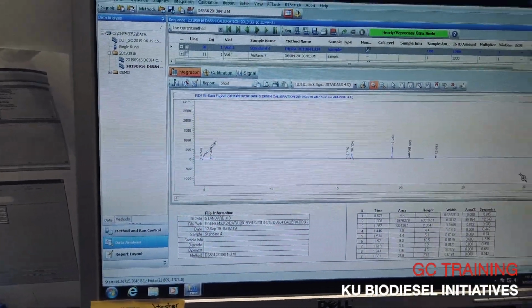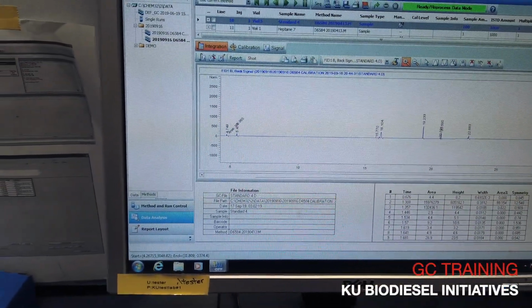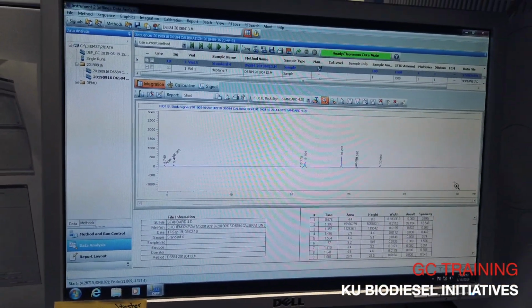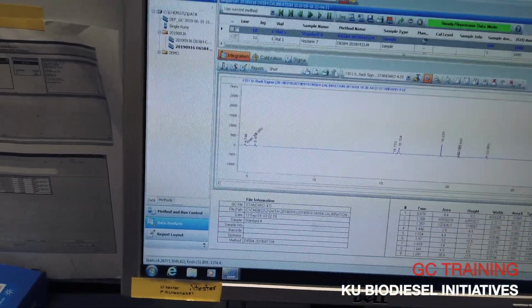Oh, I'll ask you this, Dr. Williams. Do you still have an ASTM crosscheck sample somewhere? I don't have a cross-check sample. I've got a sample of mine that came from RNG in those 2 containers that we've been using.